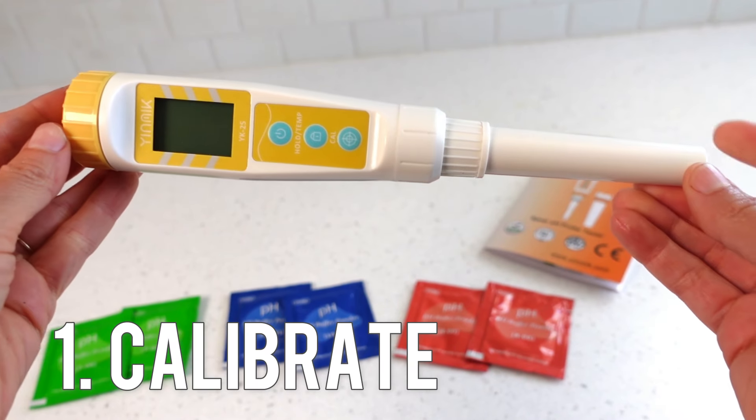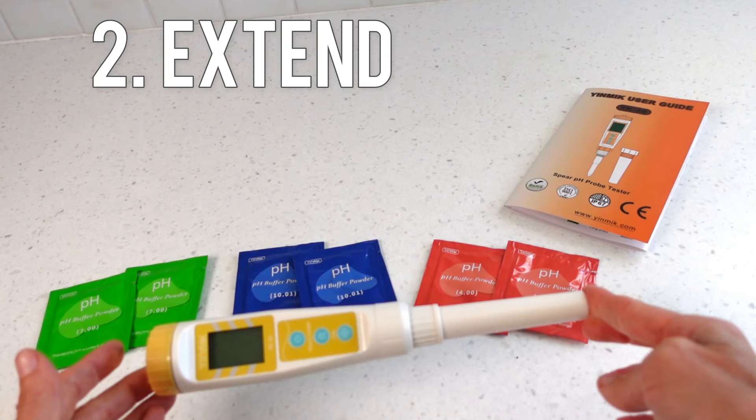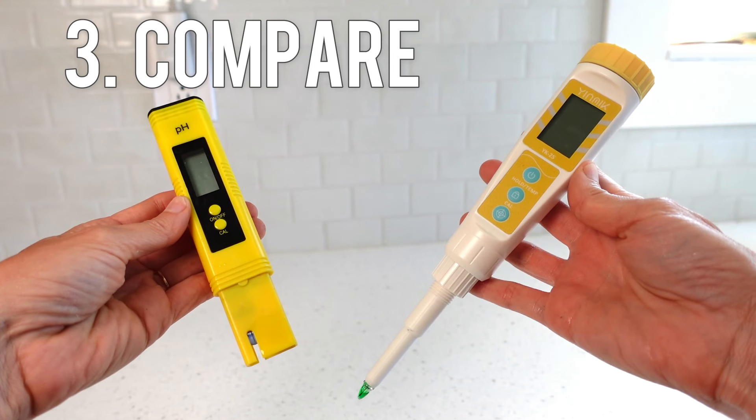This video will provide three points of knowledge. One, a step-by-step demonstration on how to calibrate this pH meter. Two, how to make these pH packets it comes with last beyond one use. Three, how it compares to this other common pH meter. Let's get started.